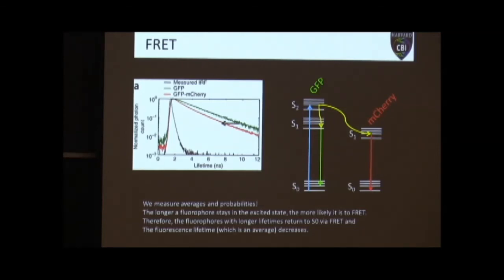And there are equations that will allow you to do that math. You have to have your system very well characterized for both your donor and your acceptor, knowing basically the probabilities of passing that energy. And it has been done, but in the past when I've looked for this data, the numbers that you need for your donor and acceptor, there's very few of them out there that you can actually find.